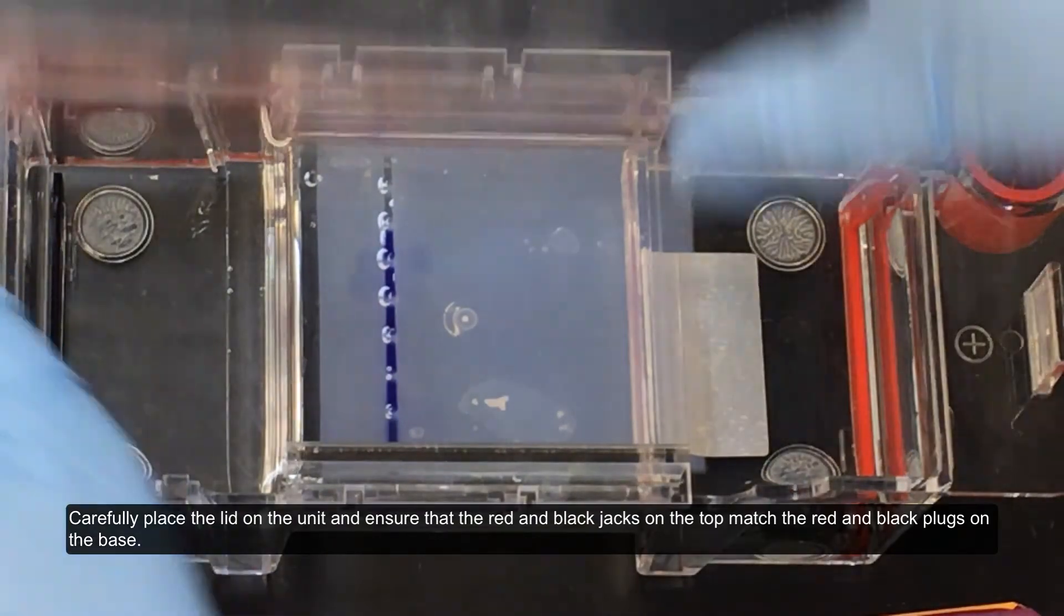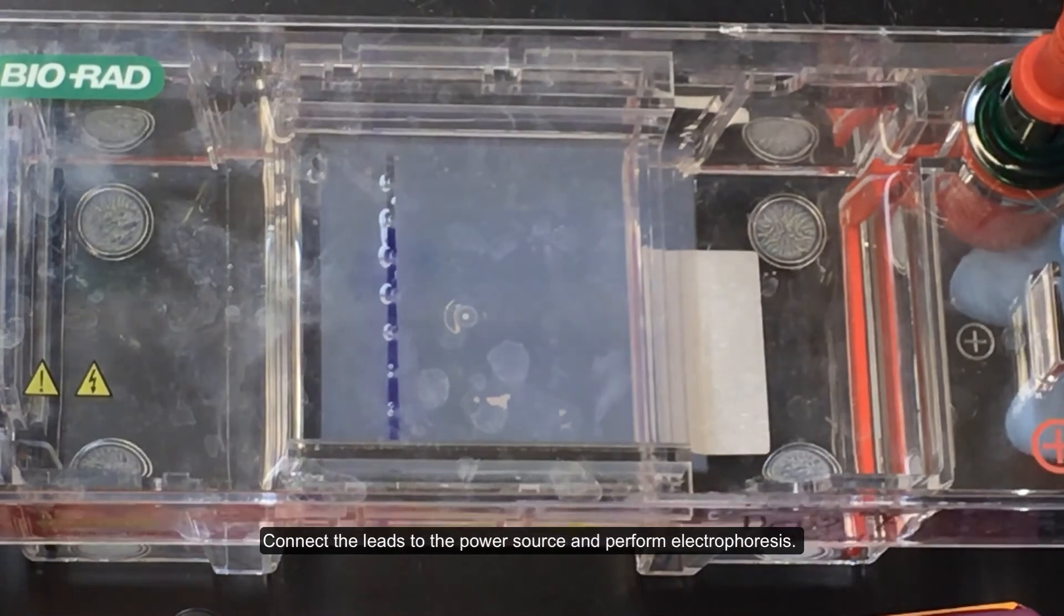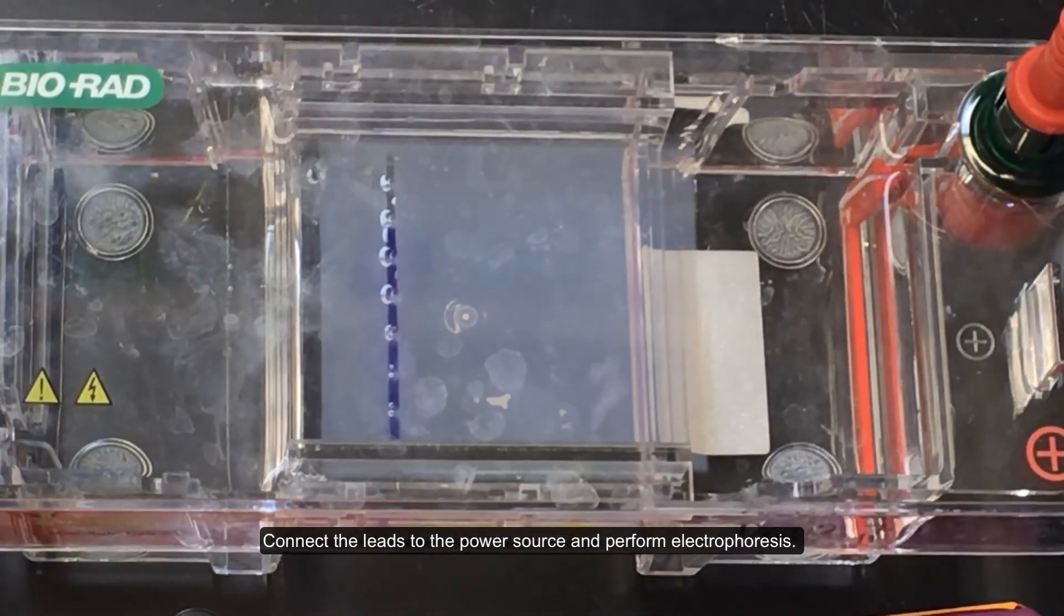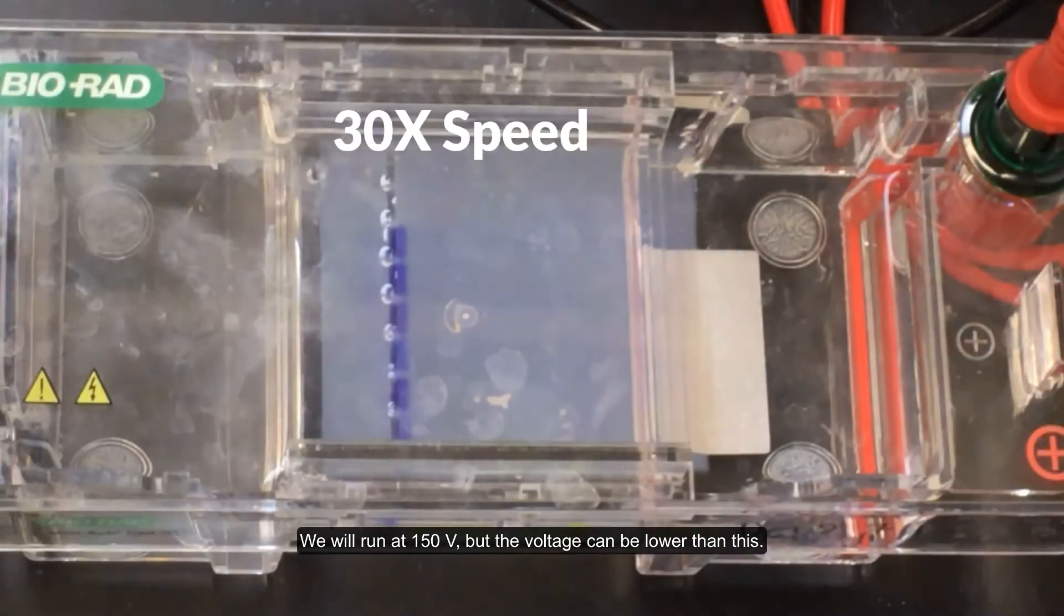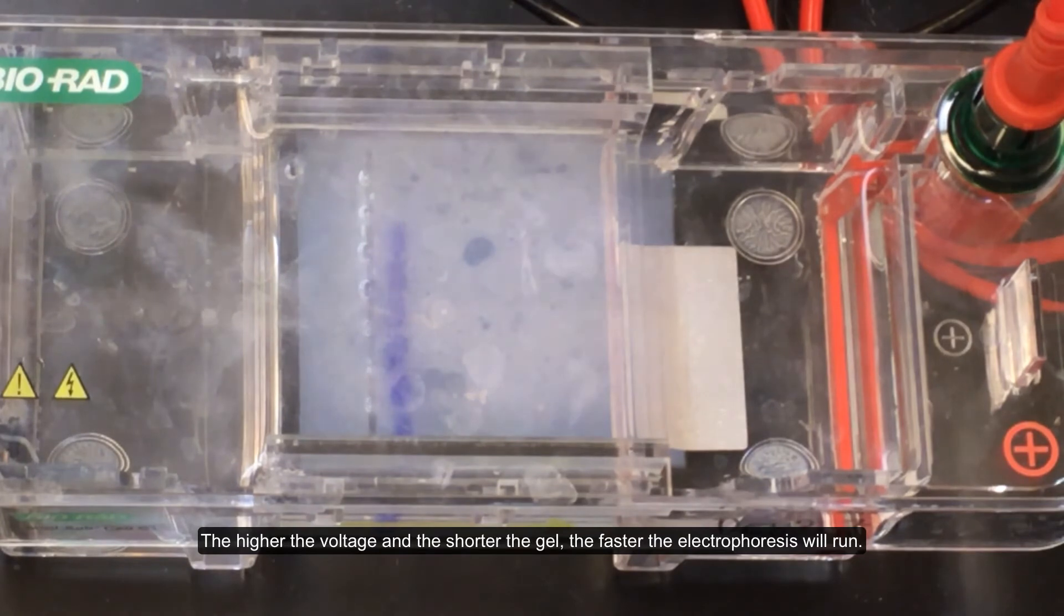Carefully place the lid on the unit and ensure that the red and black jacks on the top match the red and black plugs on the base. Connect the leads to the power source and perform electrophoresis. We will run at 150 volts, but the voltage can be lower than this. The higher the voltage and the shorter the gel, the faster the electrophoresis will run.